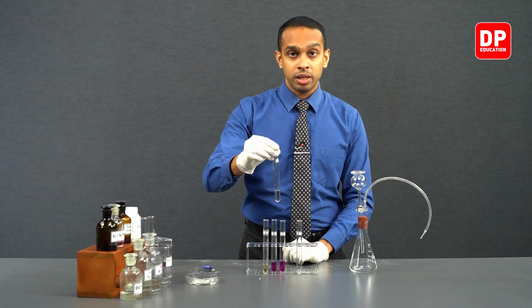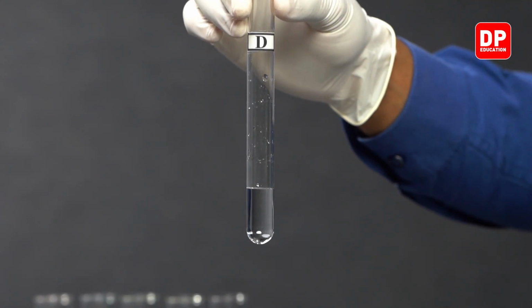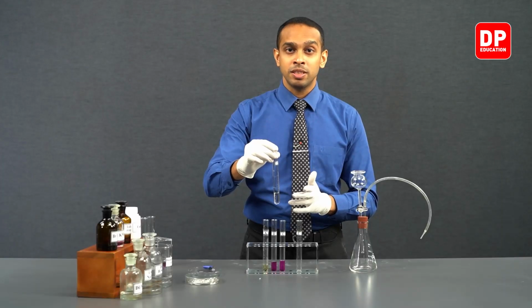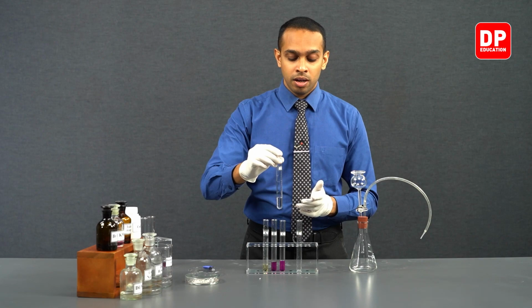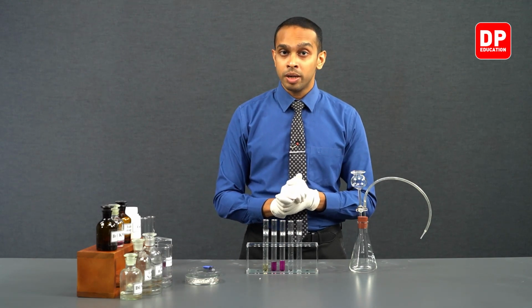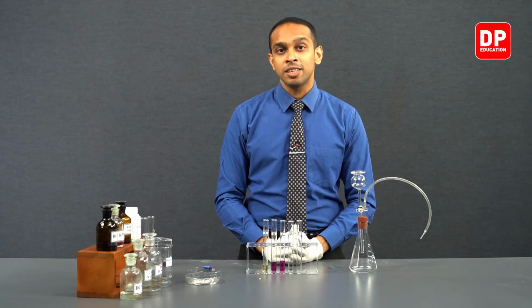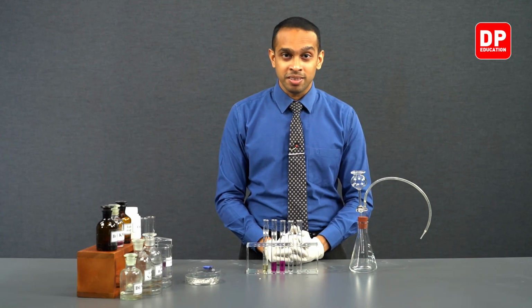As you can see, ammoniacal silver nitrate is colorless. We usually use ammoniacal silver nitrate to identify the presence of aldehydes. What happens when we react ammoniacal silver nitrate with an aldehyde and then heat up the mixture? We see the formation of a silver mirror.